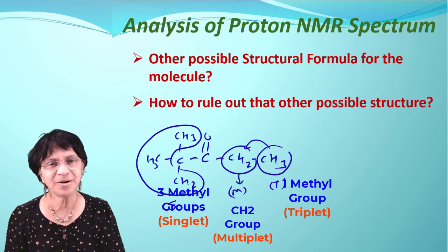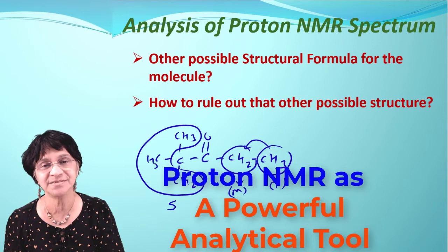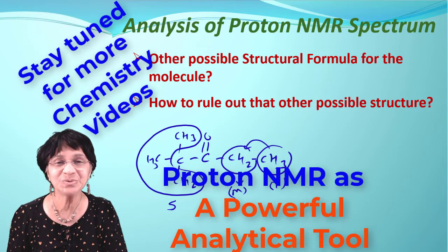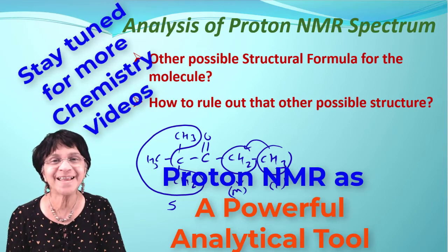And what I like about that is you can guess various structures, and then you can go ahead and see if the NMR spectrum is matching to the structure which you guessed. If you get it correct, bingo. And if not, start all over again.